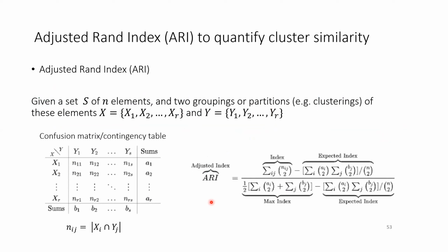So the ARI measurement can be used to compare similarity in cluster membership across different methods. For example, if we have one set of data and we perform two different clustering attempts on the data, we can then ask whether or not the same set of cells are in cluster 1 attempt 1 as cluster 1 attempt 2. If cluster membership is exactly the same, and we have the same set of cells in both clusters, we would get an ARI score of 1. If the clusters are totally different, we would get an ARI of 0.